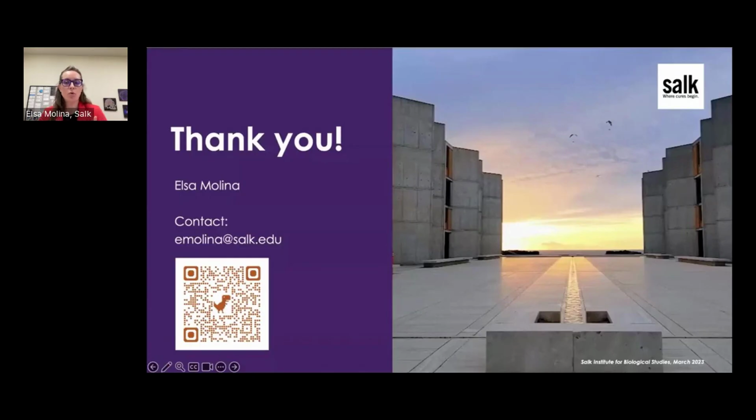You might not need to know which cells are expressing that, or all over your tissue. So that will really depend on your project. Some people are coming and would like to run spatial transcriptomics just because this is a trend. Okay, so you should never run a technology because it's a trend. You should run a technology because it's going to answer a specific question for your research project, and you will understand better the genetics or the genomics or the transcriptome or the proteome of your tissue or your cells.